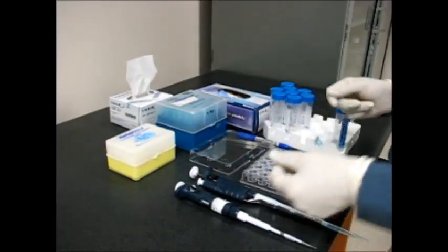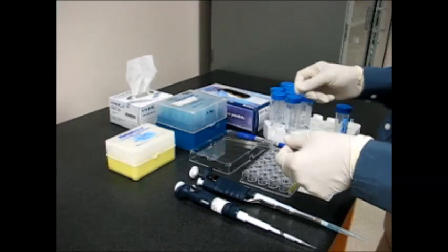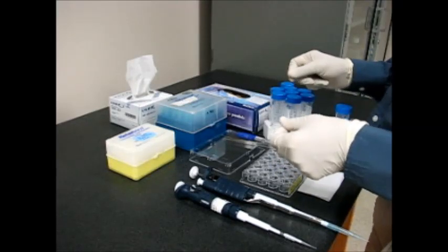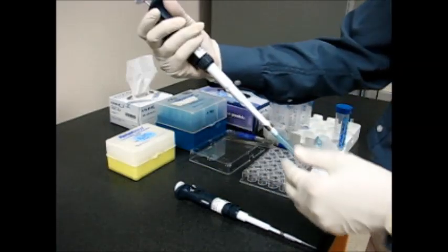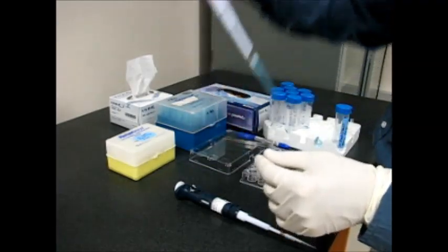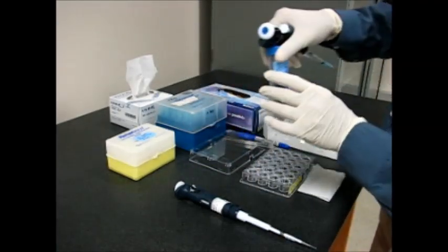This video shows how to actually set up hanging drop vapor diffusion protein crystallization. First I pick the 1000 microliter pipette and take the precipitant solution.